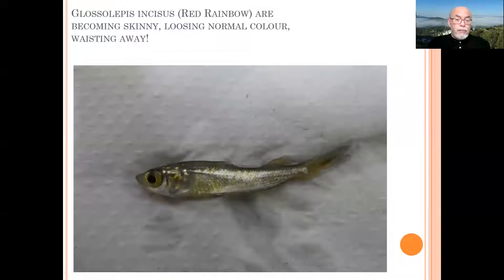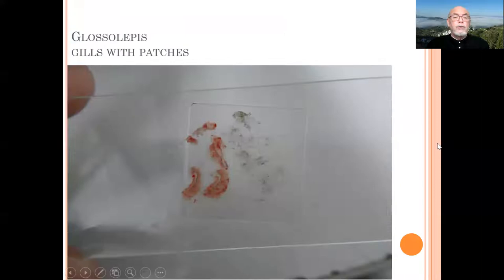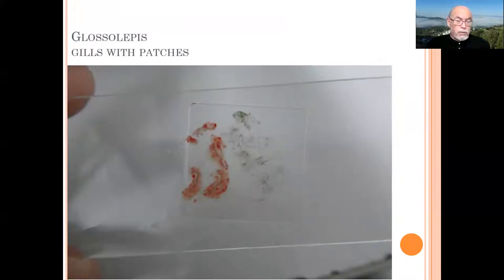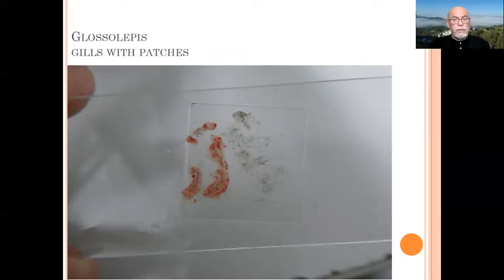If we examine that skinny fish, you take tissues from the scales, some skin scrapings, and you take some gill tissue. That's the most important part you usually examine in those fish.